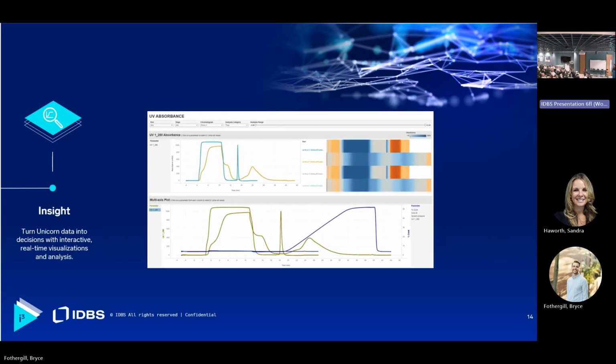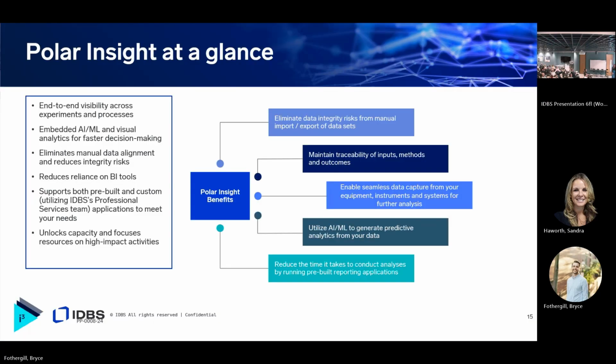Awesome, thank you. So we have arrived at the last stop of the road trip, Polar Insight. So for those of you who are not aware with what Polar Insight is, it is our analytics engine within Polar. It's a separate module within Polar where we have all of these Polar Insight apps that talk to a wide variety of things.